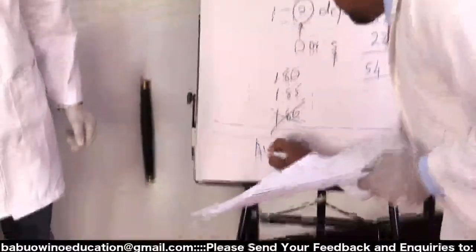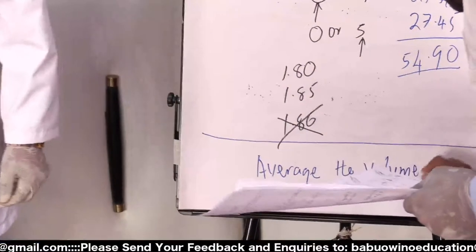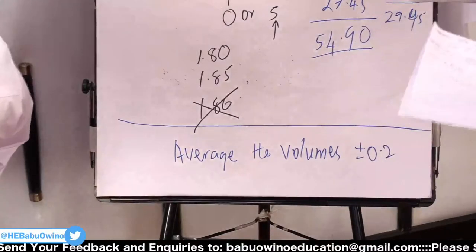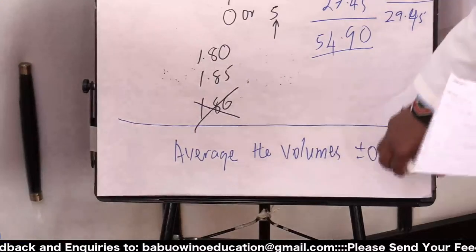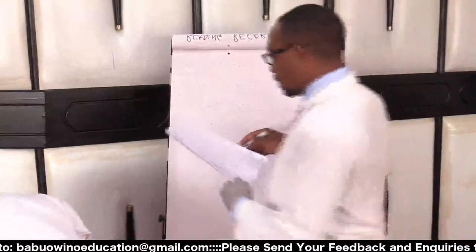Here you average. You average the volumes within plus or minus 0.2. So the ones that are within that are this and that. Now, where do we move from there? From there, we now work out what that one means.